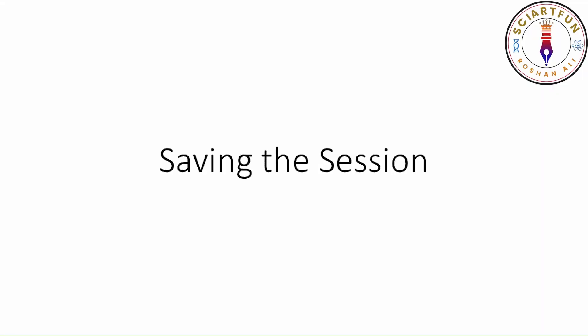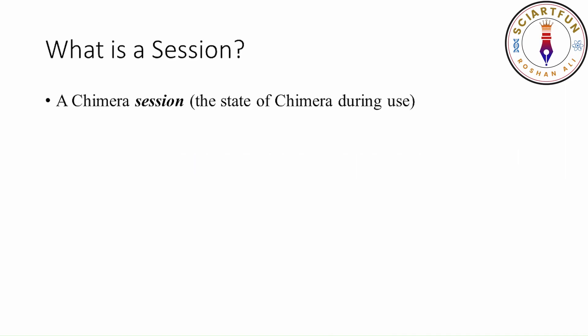Our next objective is saving the session. A Chimera session is the state of Chimera during use. It means that you have opened a file in Chimera and it is in certain state, means how much zoomed, which position in the window, how much rotated, what added, and the colors etc of the structure. All these things are saved in a python file with .py extension. That file is called session file of Chimera.